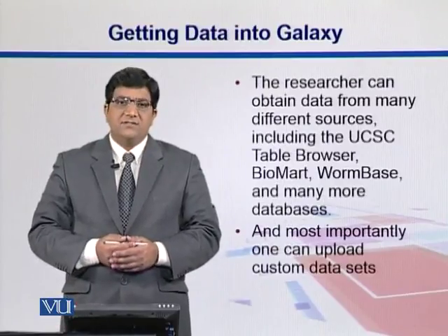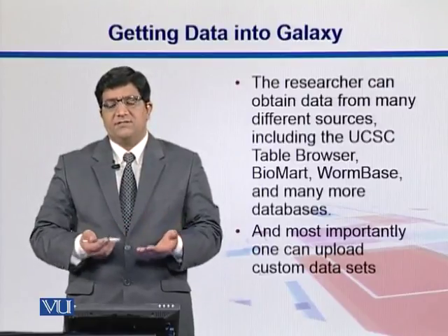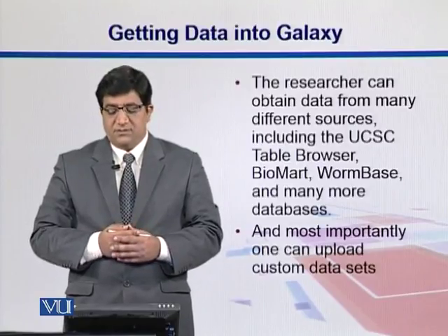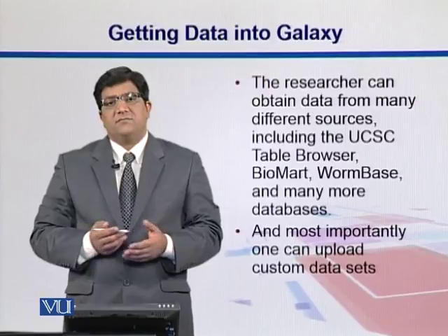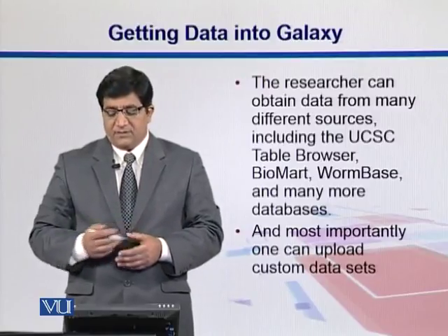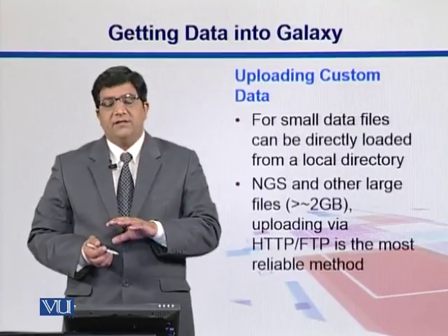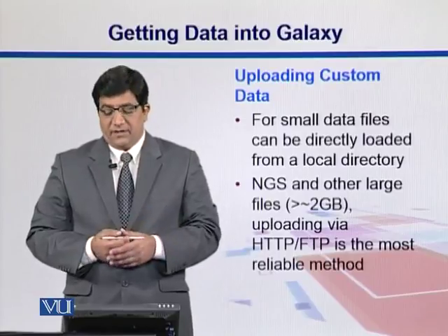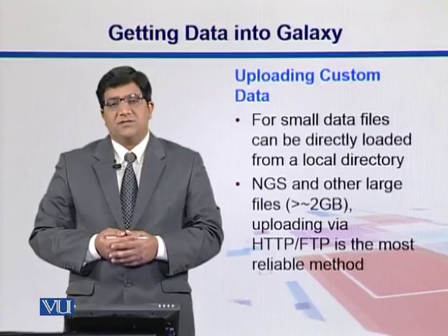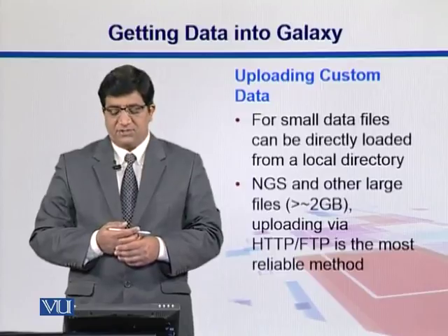What we can do with Galaxy is upload our data sets and do some initial analysis on them, but obviously we can do that for small data sets. We can also get data from different databases, since they are linked with one another. As far as data loading is concerned, we can directly upload our data from a local directory, but for big data sets we might want to use file transfer protocols, FTP or HTTP.